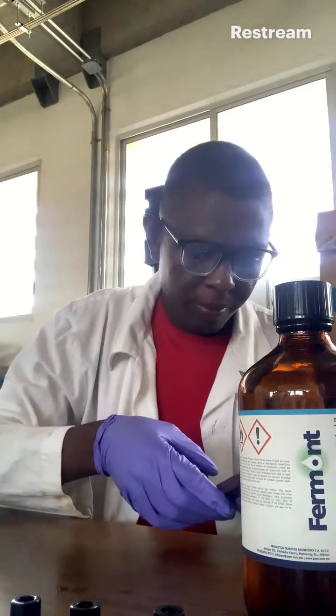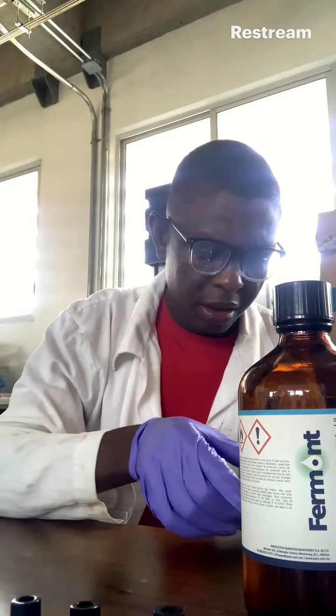So let me tell the technician that I am done.